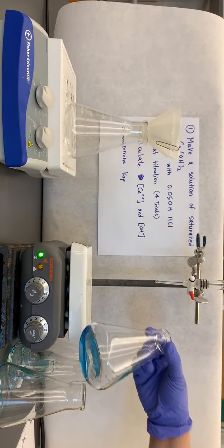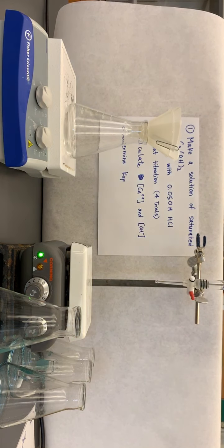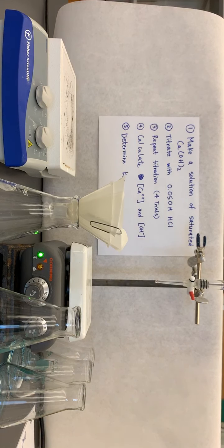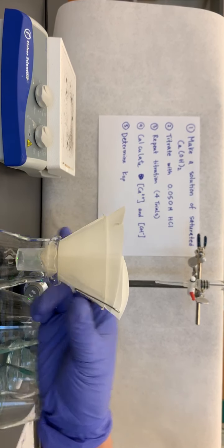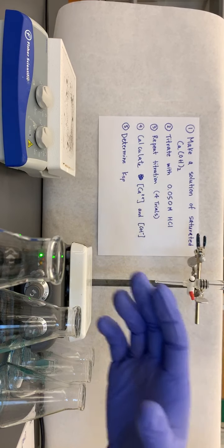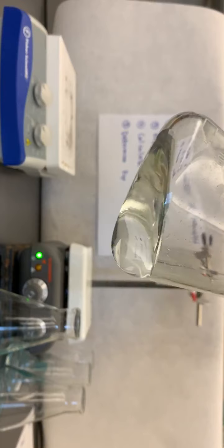Okay, so I'm going to go ahead and put this on the plate eventually. So this looks like it's doing a fair job draining. Okay, so I'm going to go ahead and start transferring or adding my 5 mils of the solution into each of my flasks. I'm going to meanwhile allow it to continue draining into a secondary flask. So if I need more, I have it. Okay, but really I do have probably enough to do at least a couple of trials.